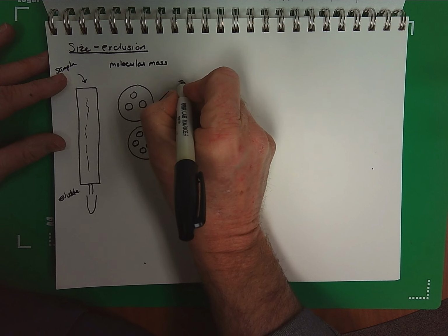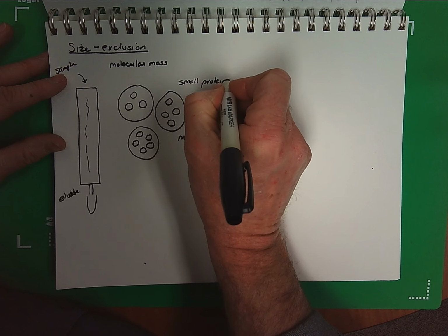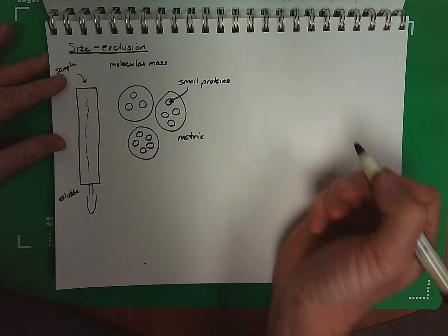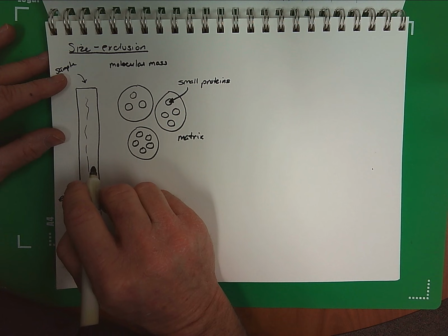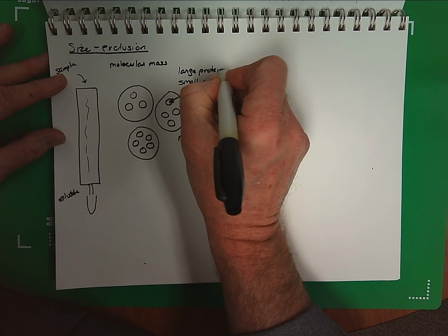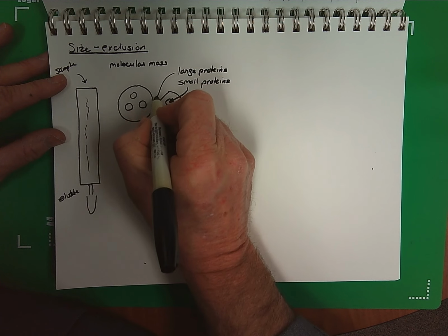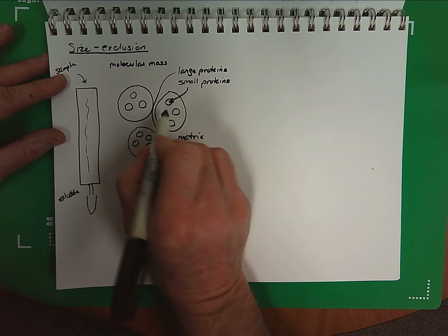Small proteins will enter the bead because they fit through these small holes. Large proteins will not fit through the hole, and they will percolate between the beads because they do not fit in the hole.